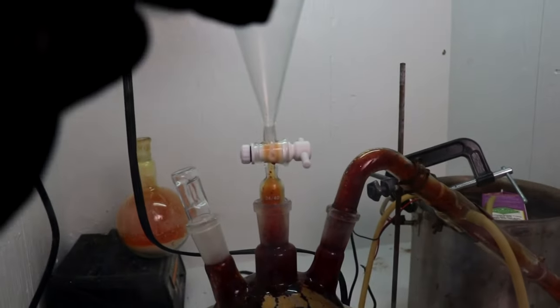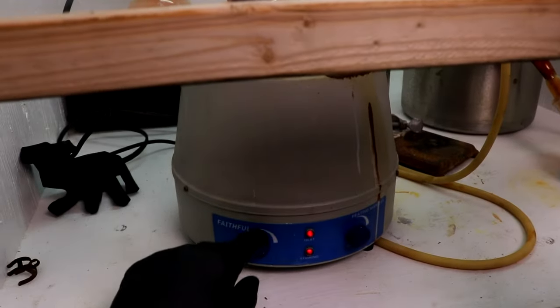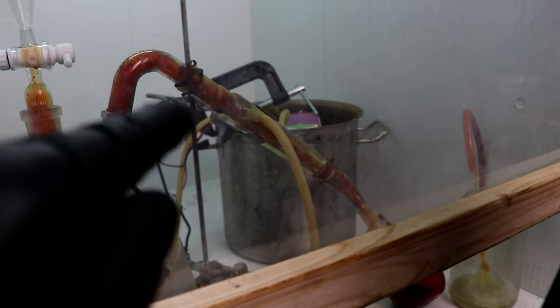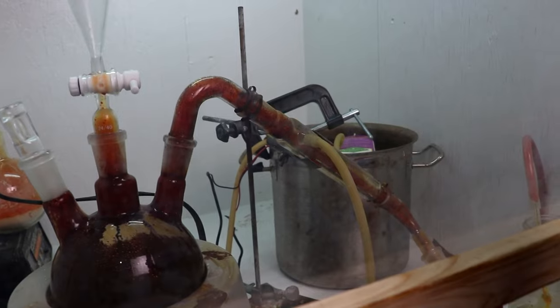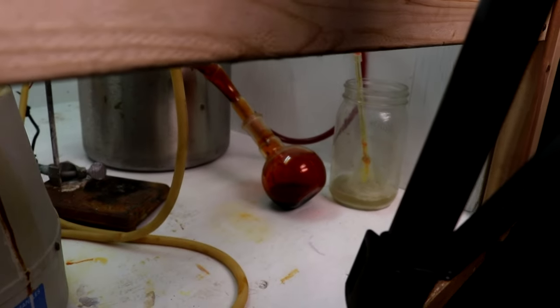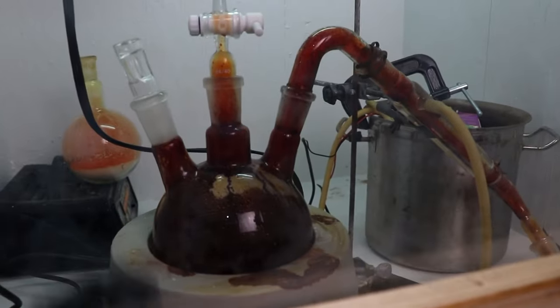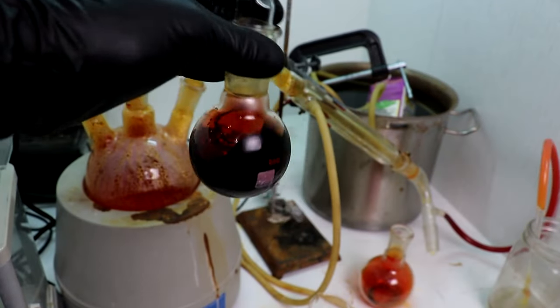So, all of the acid is in. I've got the heating mantle on. Bromine's still coming over. It looks like quite a bit. I think I'm going to get a pretty good yield out of this. Obviously not 100%, but alright, got the bromine in my little Nile red flask.